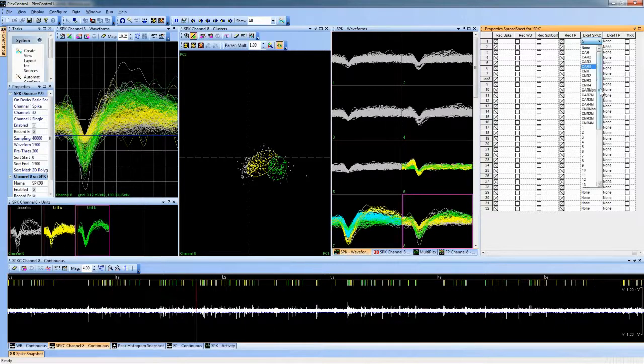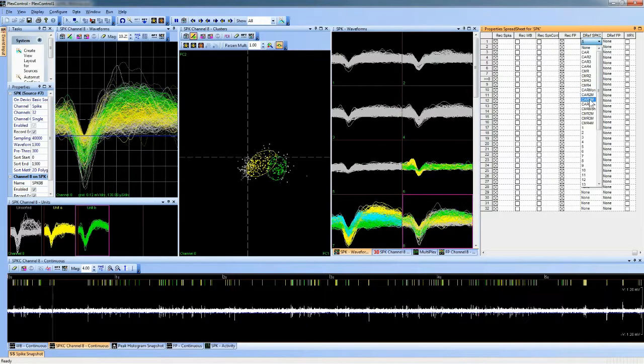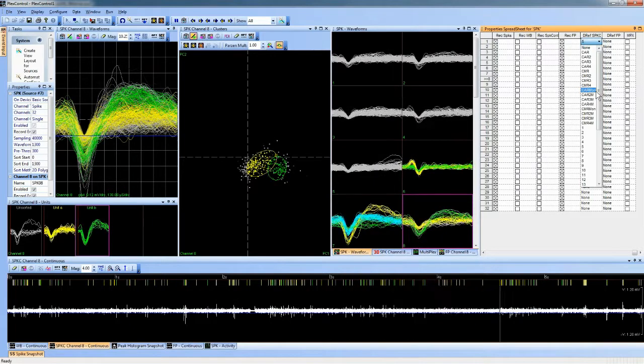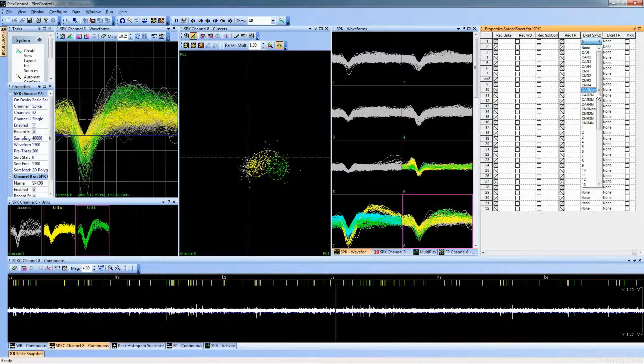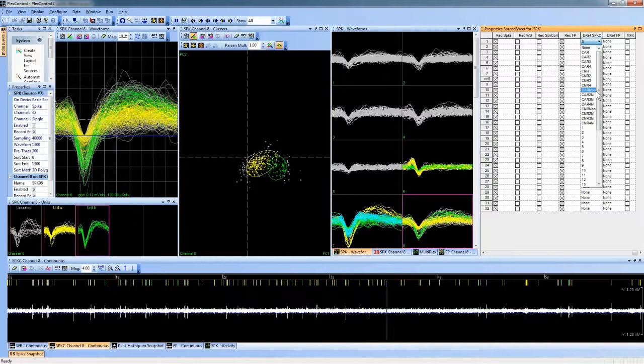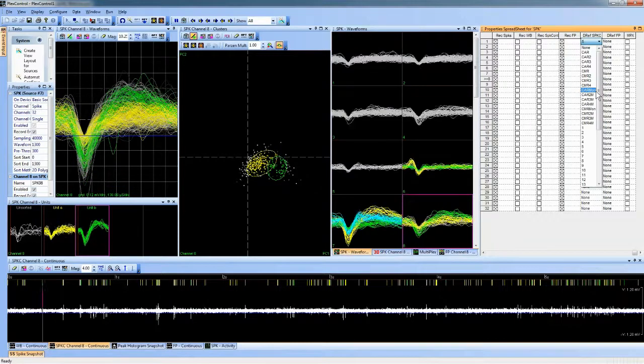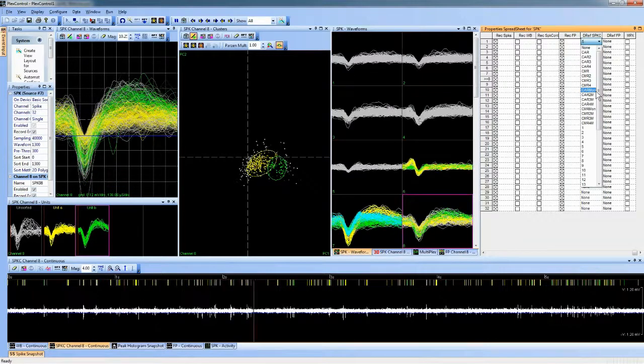There's also the option for CAR-MON, or CAR2-MON, 3-MON, 4-MON, etc. The MON here stands for the monitor. So if I selected 10 channels to be CAR1 or CAR, and I had an 11th channel that didn't have any signal that I was interested in, I could set channel 11 to CAR-MON. And what that will be now is, instead of showing me the data from electrode 11, it would be showing me exactly what that average is.